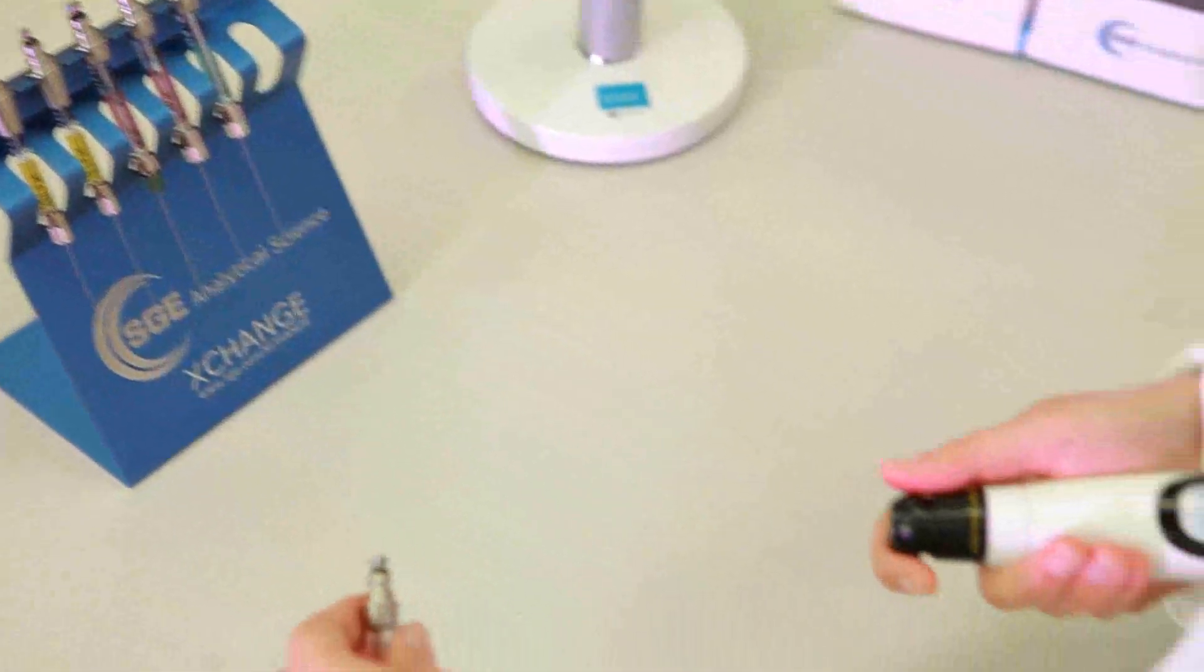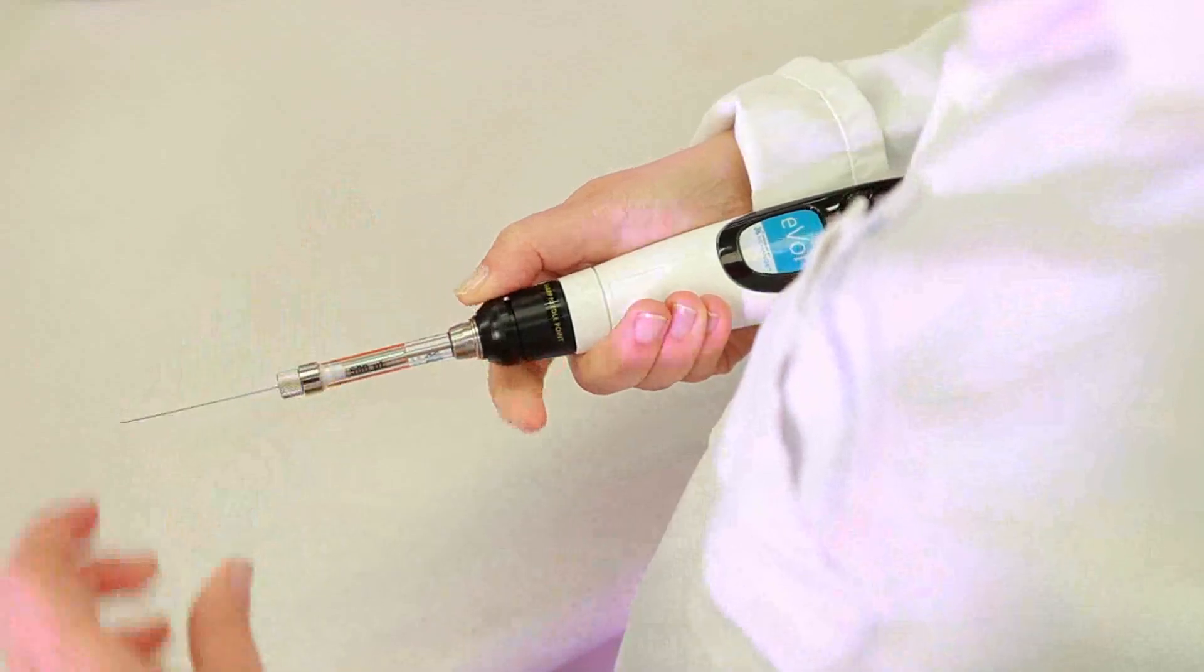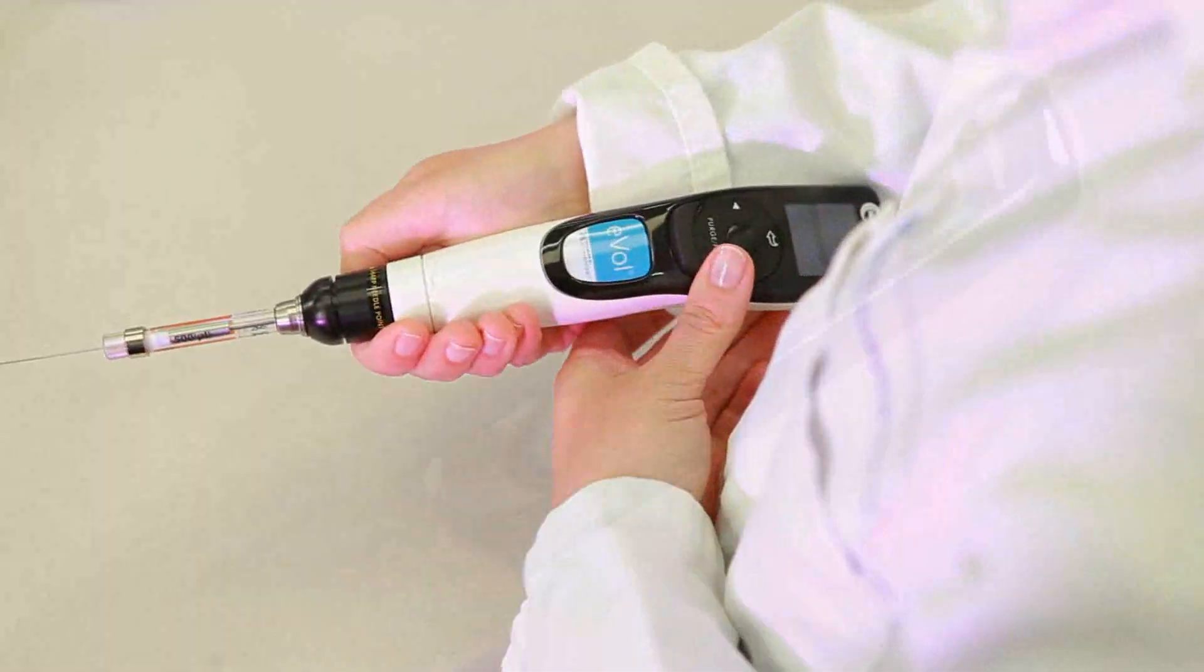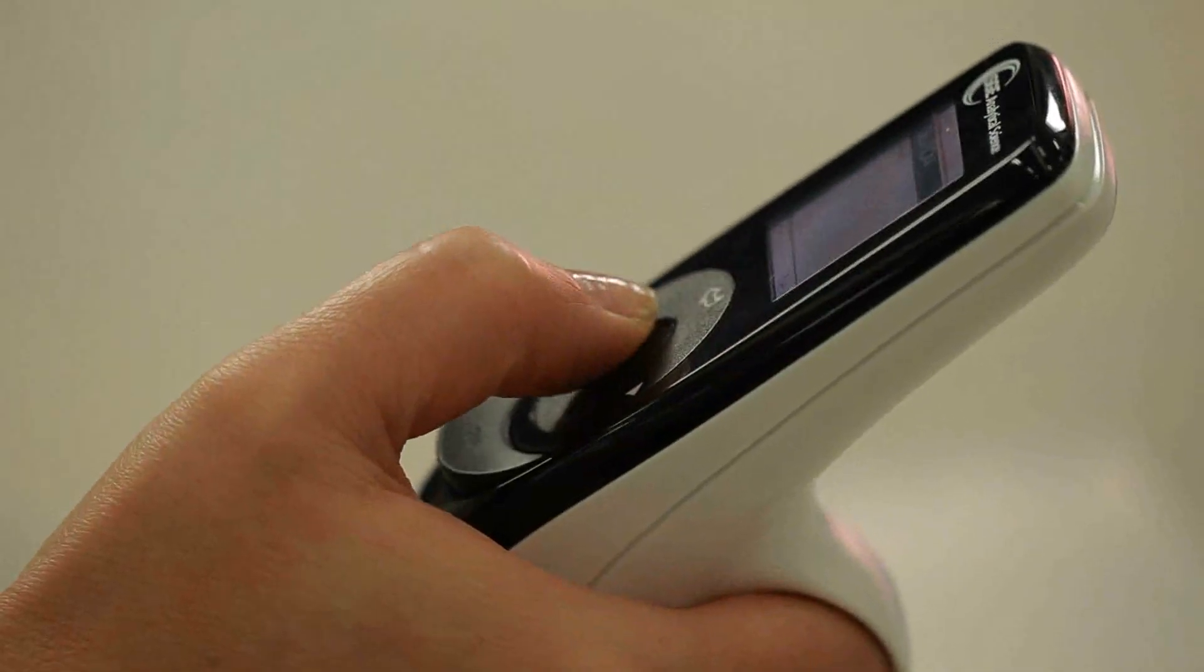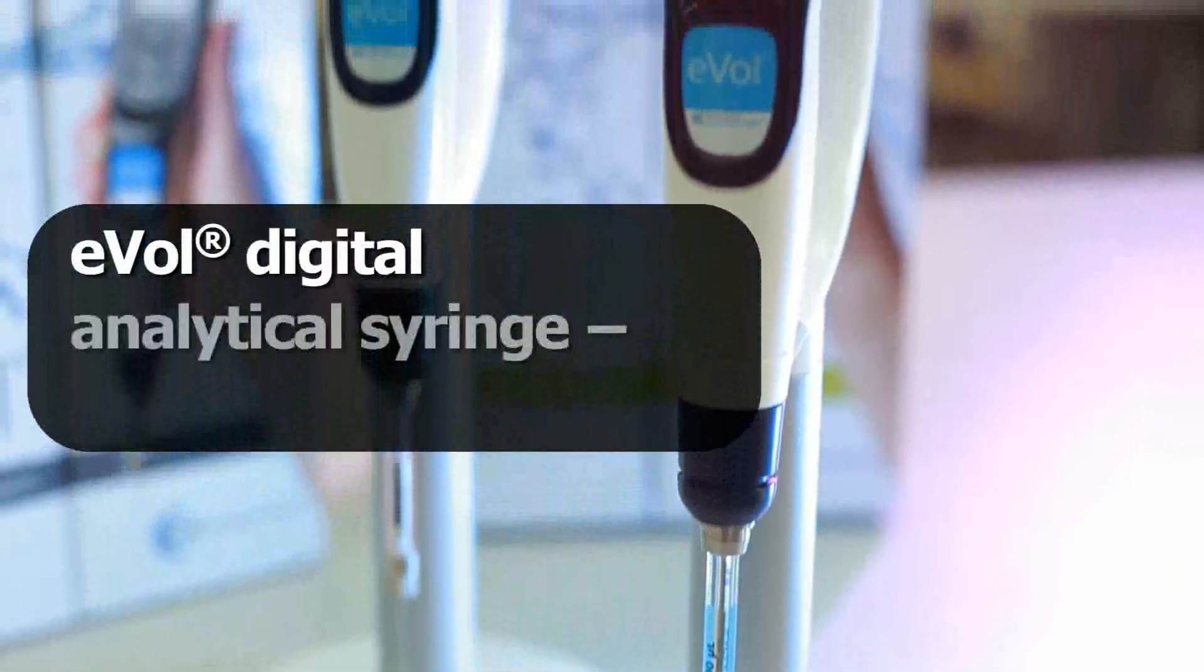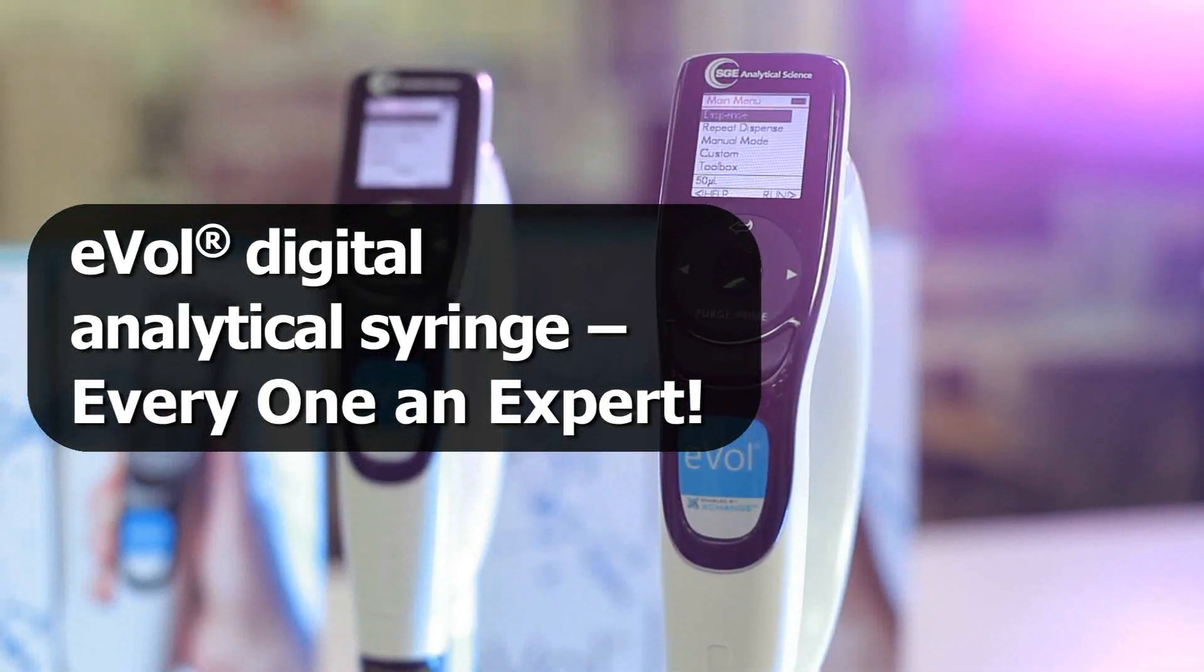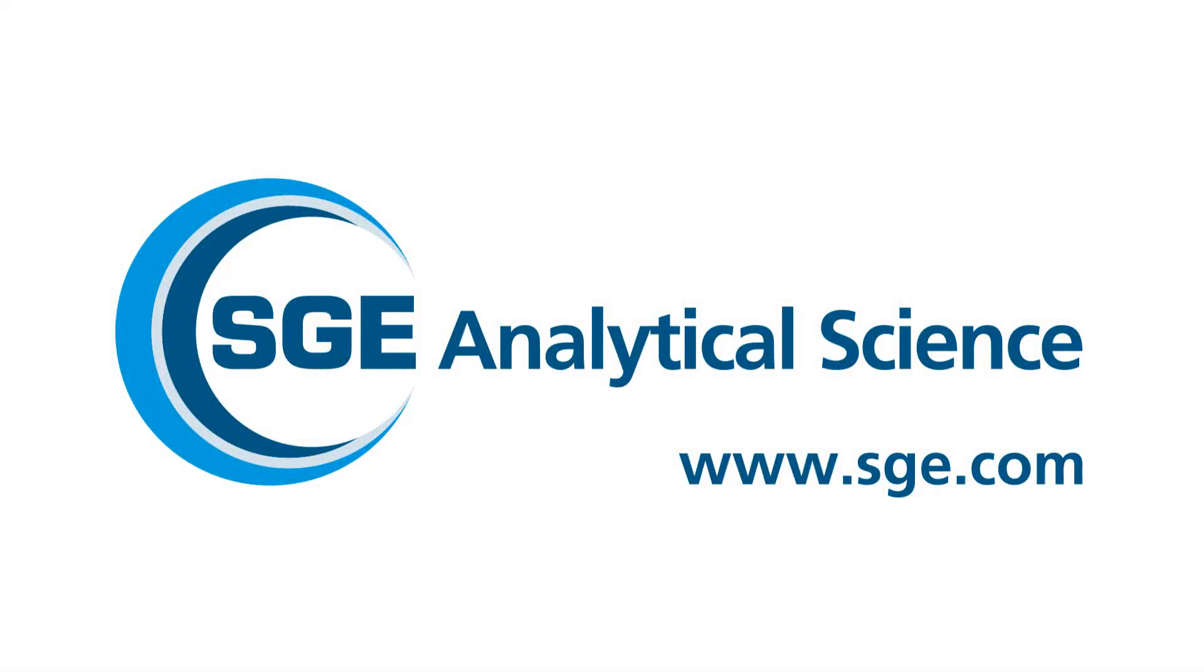Now you are ready to take your EVOL use to the next level, all while maintaining accuracy and reproducibility of results and adhering to strict global laboratory standards. The EVOL Digital Analytical Syringe, making everyone an expert in fluid handling.